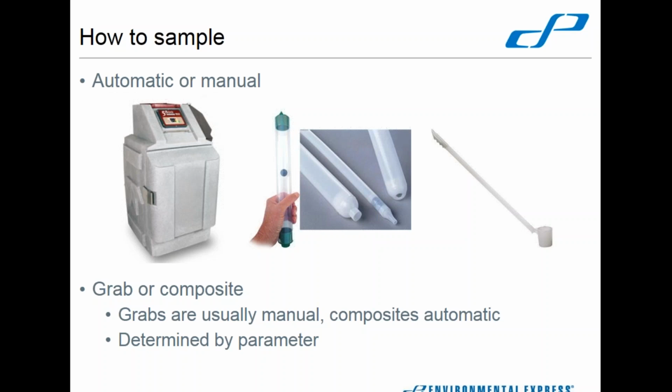And depending on the actual flow of the sample, we're talking about water samples here, aqueous liquids. Depending on the flow of the liquid through that spot, it could be just an every hour grab of 500 milliliters of sample or whatever it is, or it could be a flow adjusted average, where you know that like in a wastewater treatment plant, you've got a higher flow during the day and a lower flow at night.